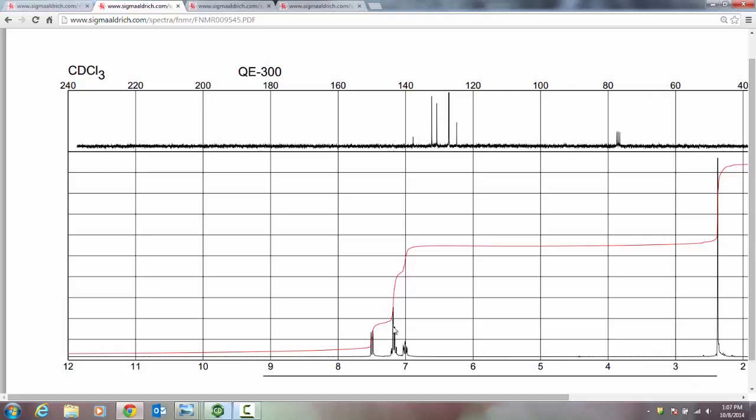What we have here, unfortunately, is a doublet, the 2 taller peaks on top of a triplet. So little, then it goes up to the smaller of the 2 tall ones, and then a little one. I know that's terrible, but that's oftentimes life. It's definitely not just one triplet. But that's an ortho substituted ring.